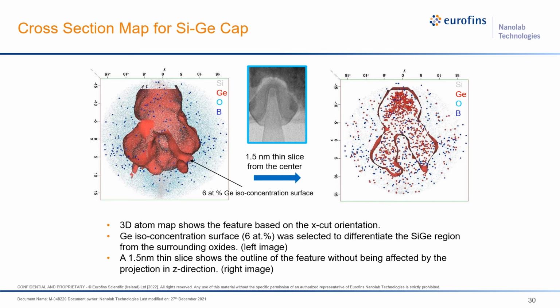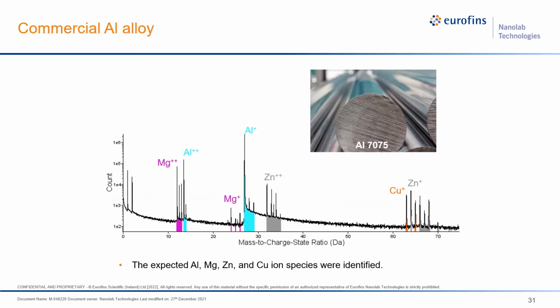probe tomography. And this is one thing which I really want to stress: observing boron in 3D, specifically at such low concentration, is actually not possible using SIMS, STEM EELS, STEM EDX, or any kind of 1D or 2D techniques for these FinFET structures.